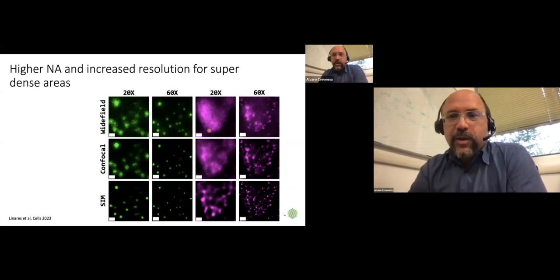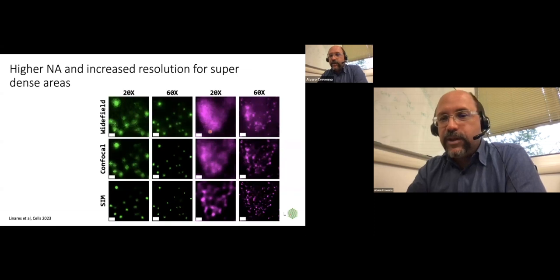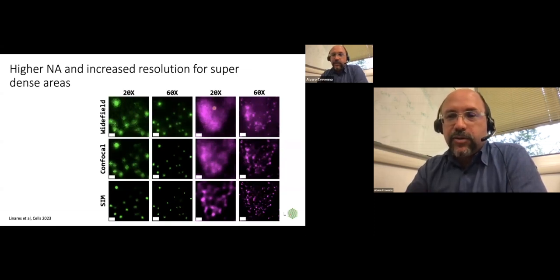I've always wondered, especially when you have hundreds of counts per cell and you're using color combinatorics, how reliable is the quantification in those cases if what you would see is a blob? If you run a spot detection algorithm, it will give you something, but how much should you trust the spots that are inferred from this?